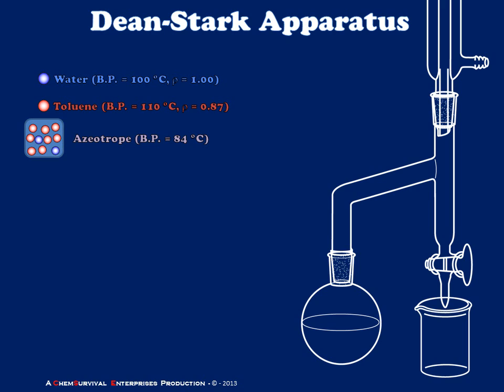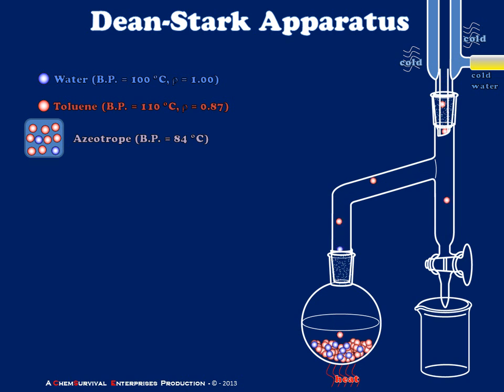Let's see if we can separate the water from the toluene using our Dean-Stark apparatus. I'll begin by charging the boiling flask with my mixture. Next, I'm going to plumb my cold water into the reflux condenser, creating a zone of cooling where vapor will begin to condense. As I apply heat to the system and my mixture begins to boil, we'll see that the azeotropic vapor reaches the reflux condenser, cools, and then falls downward into the trap. This liquid accumulating in the trap is cold liquid — not boiling liquid — so our toluene and water will phase separate.